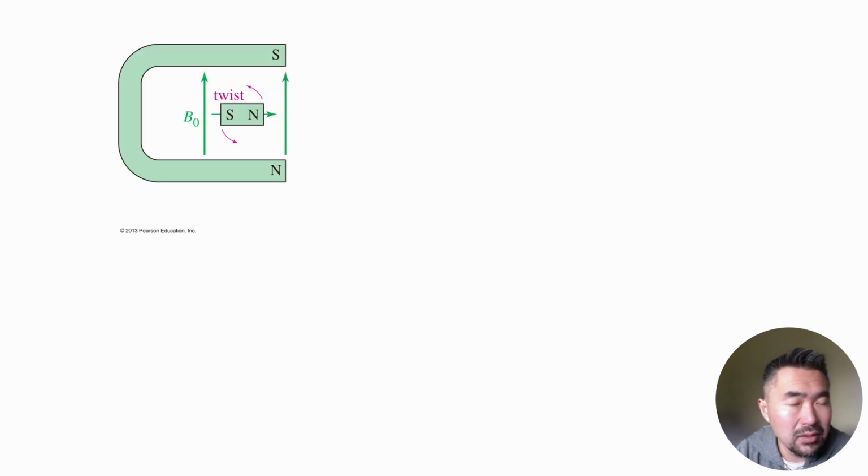That's the idea. So the visual picture you could have in your mind is a big strong magnet applied to the sample. Remember that picture of the NMR instrument from a couple of slides ago? The spin direction of the subatomic particle like the proton, which is the main thing we're going to be looking at, so I'm just going to say proton.